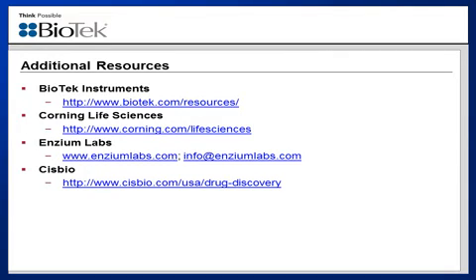This project was run as an example or a confirmatory project to show that this type of assay could be performed, with the inclusion of the spheroid microplates, the Citation imager, the software, and the different types of assay kits that were included.